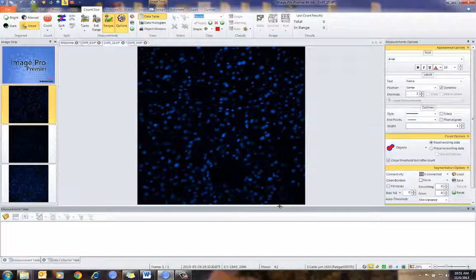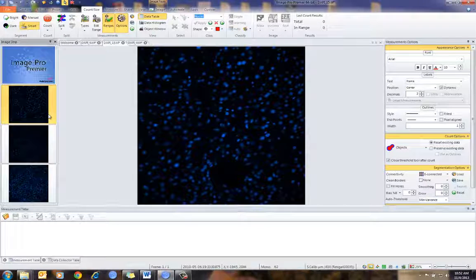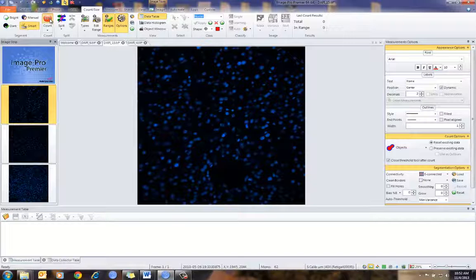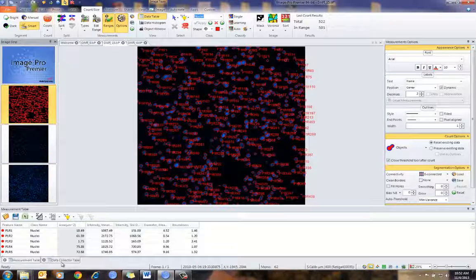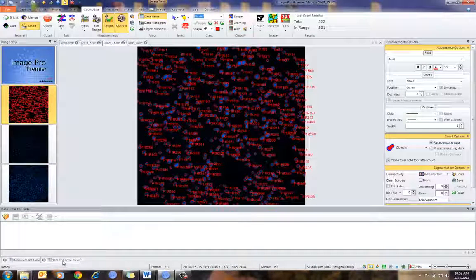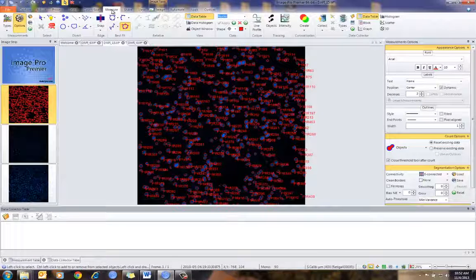I've already set this up to collect data from images when I count them. There are a couple of ways of doing this. One is I can simply go to an image, count it, and then go into my Measure tab and collect.